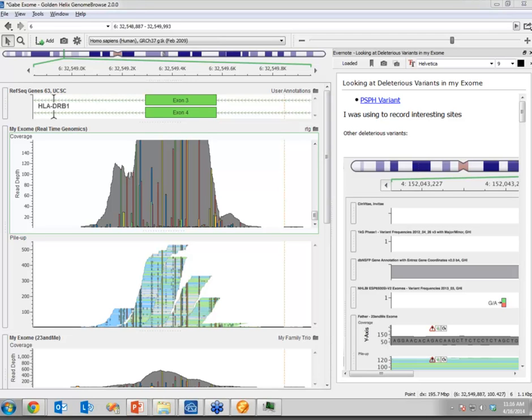Although with certain classes, again, if you're targeting 2 genes or even 30 genes or 100 genes, there are the confounding issues in terms of the repeat regions around those genes. CFTR's got a nasty repeat region right beside one of its exons, right? And you know how to handle those, either masking them or accounting for the fact that you're going to have false negatives there. That's all well and good, and I think there's no reason why NGS data won't become the primary diagnostic tool for clinical uses. It's just a matter of doing the proper test development.